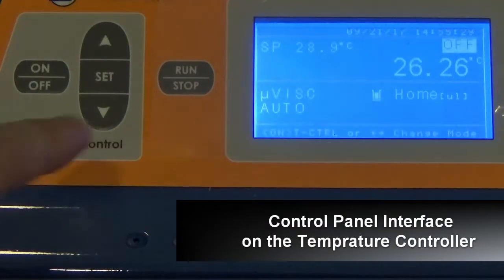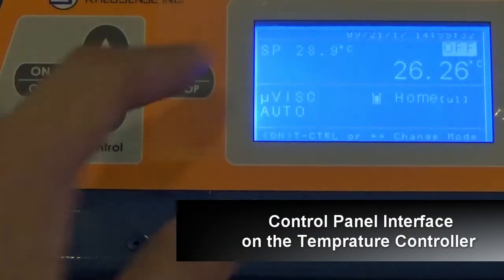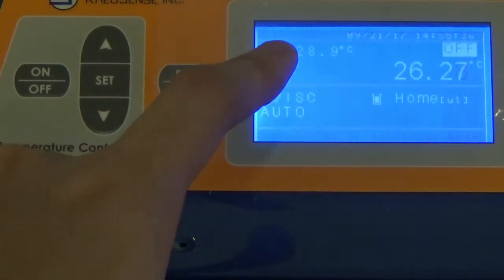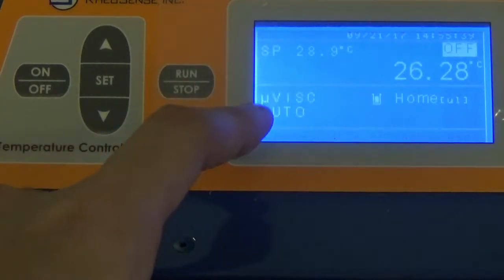As you can see here, there's a temperature control panel. At the display panel, you can see this additional temperature setting. The modes here remain the same as the microVISC, which are the auto, advanced, and cleaning modes.